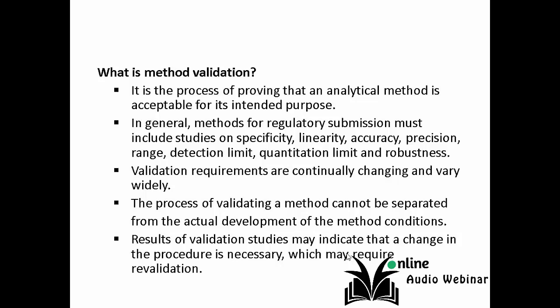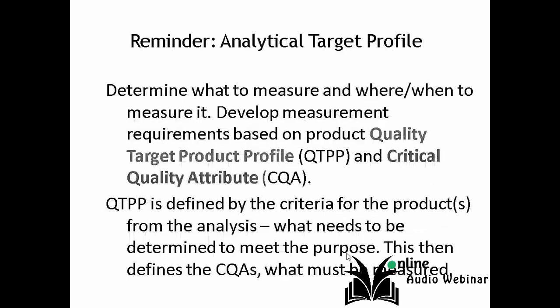For protocols, the method validation is showing that a particular method performs and does what it is supposed to do. This is supported by a report. Once again, these are reminders that things vary and change.